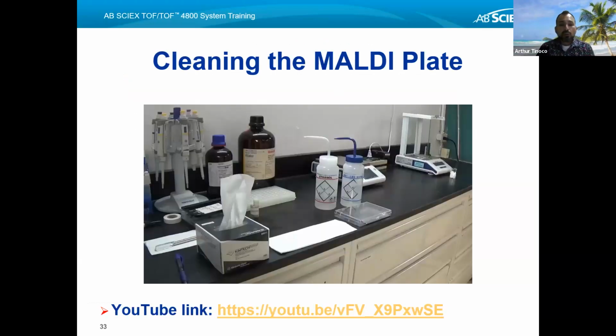All right, so what I'm going to show you here is a video of the process for properly cleaning your plates. Many of these plates have been used a lot, so you will see that they have been worn down a bit over time. You'll see some scratches and things like that. The key thing, if there's a plate that's been used a lot, is to avoid sections of the plate that have been damaged over time, because to some extent, some of these solutions that are made will damage the surface of the plate. So I'm going to show you the protocol for how to maintain the plates in good condition.